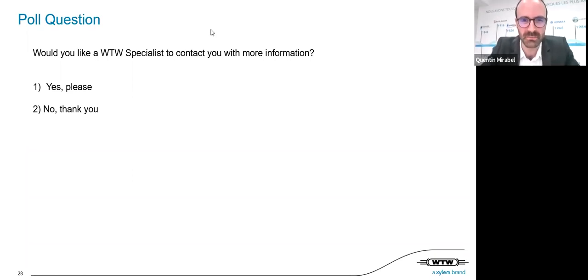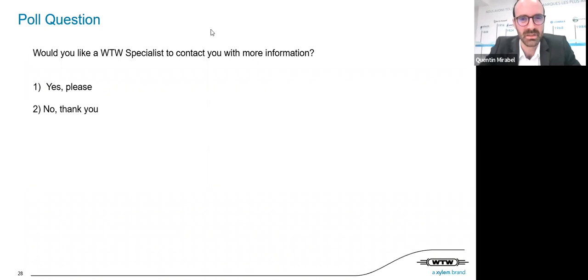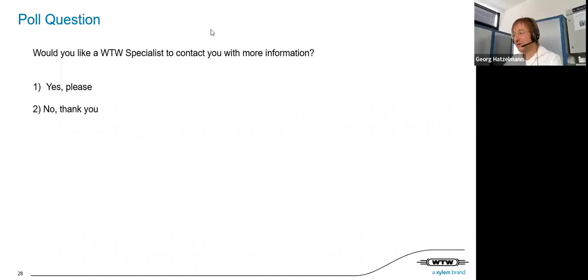Another question. What is the minimum life of a UV-Vis 7051? Okay, the typical lifetime of our sensors is in the area of 5 to 15 years. Okay, another question about flash lamp. What will be the life of the flash lamp? I think it's the same answer. I don't make a separation of the board or the LED or the flash lamp. In general, our sensors are designed for a lifetime of typically 5 to 15 years.